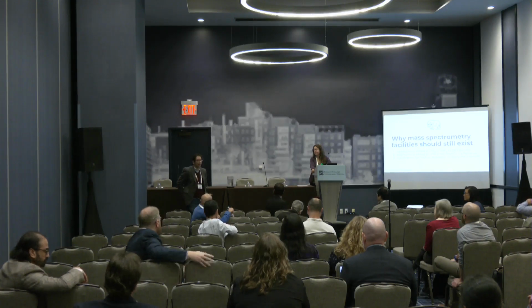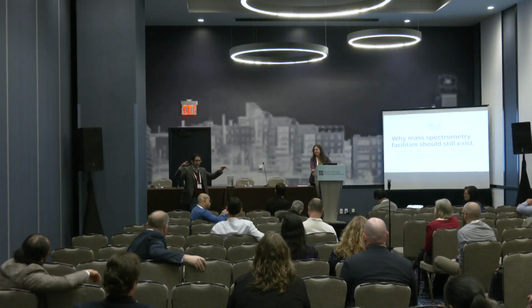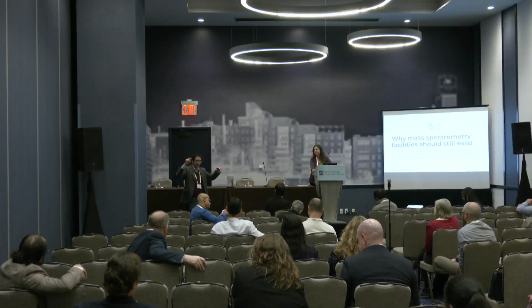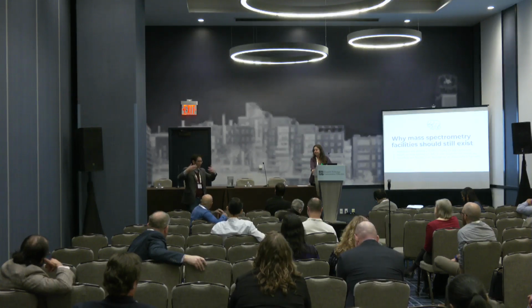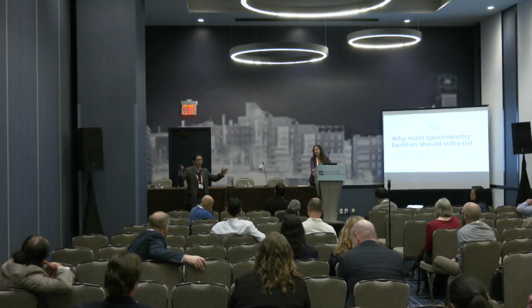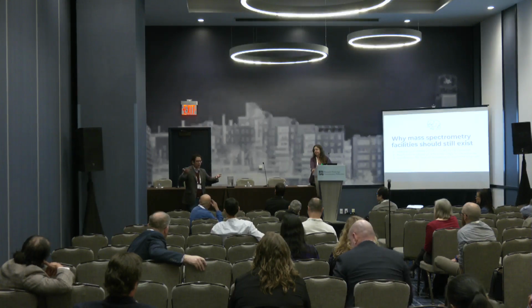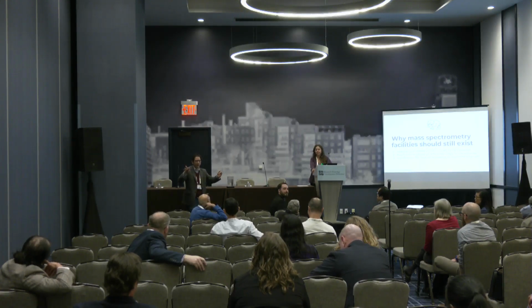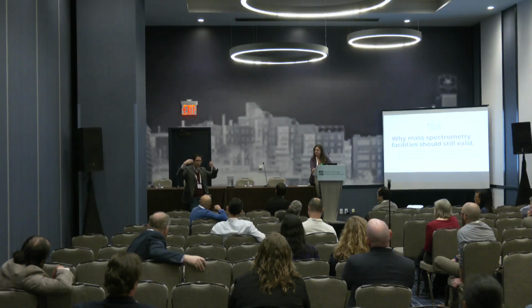Yeah, I think that there's room for all of us on this stage, right? For everyone to have a say in this. And I would say that the things that as mass spectrometrists we should be letting go of are the cases where we have to deal with huge throughput, right? Where we're talking about multiple thousands of samples. Those are circumstances where you've got very clean proteins that you're interested in analyzing. Those are things that there are better technologies to deal with that specific problem. But I would argue that mass spectrometry works really well on both ends of that spectrum, on the low throughput side, right?